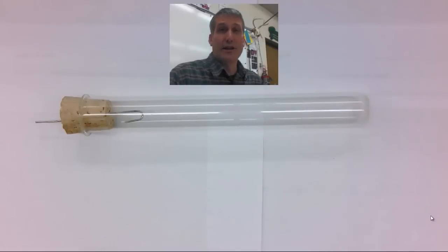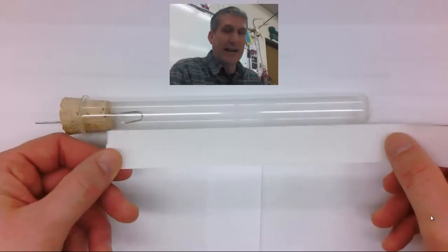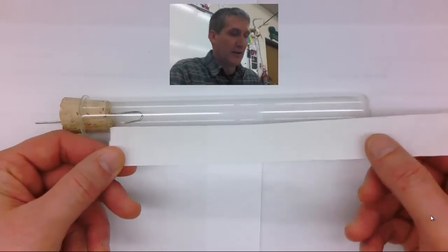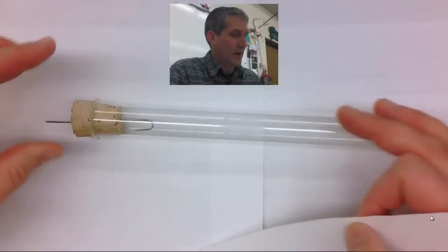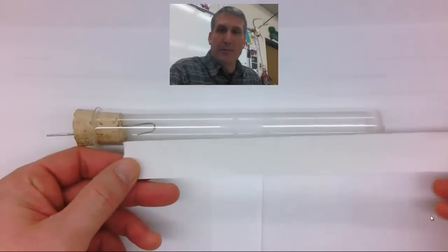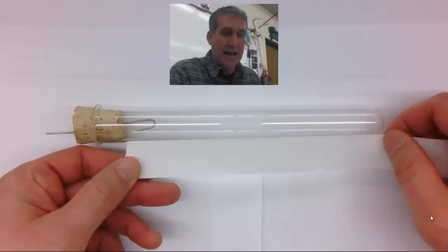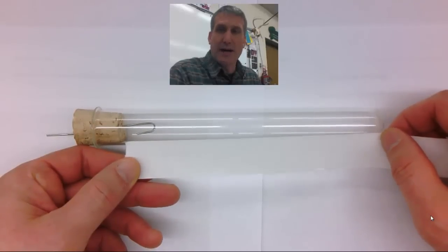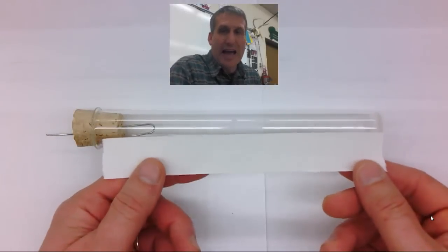The first thing we want to do is get a piece of chromatography paper that is the right length to fit inside the test tube so that it goes all the way down to the bottom. You take the test tube, insert the cork in the end, and then hold up the piece of chromatography paper so it almost comes all the way up to the cork and extends all the way to the bottom. Then you simply tear the chromatography paper at that length.